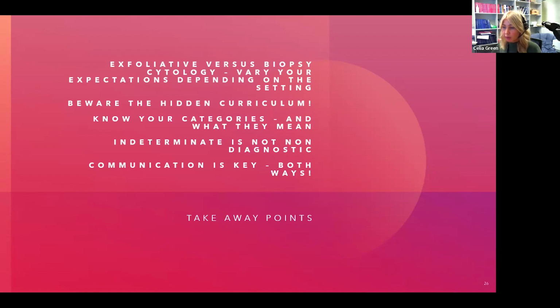So what we do is we gross the specimen, we take the lymph nodes from the hilum, we take the resection margin, we sample the tumor, and we put them in little blocks at 3 to 5 millimeter sections, and then we cut 5-micron sections from that. So yeah, a whole lung will not be processed, but a whole biopsy that's a small biopsy will be.